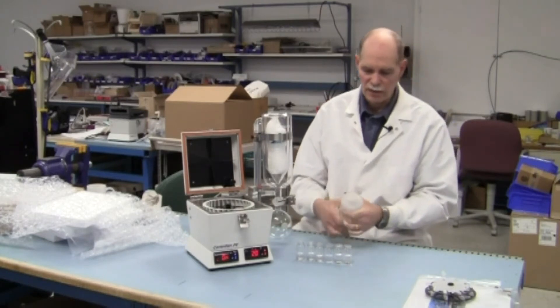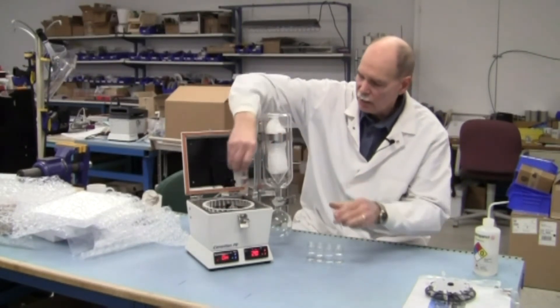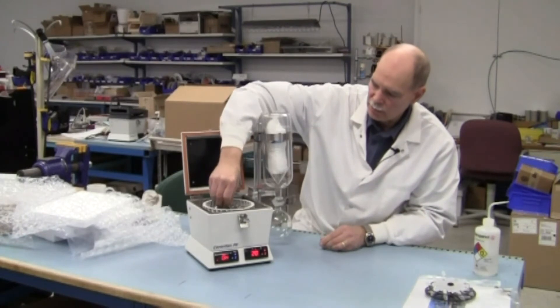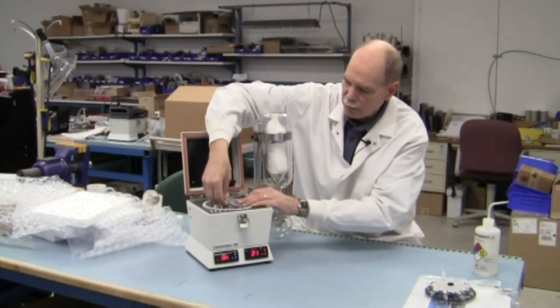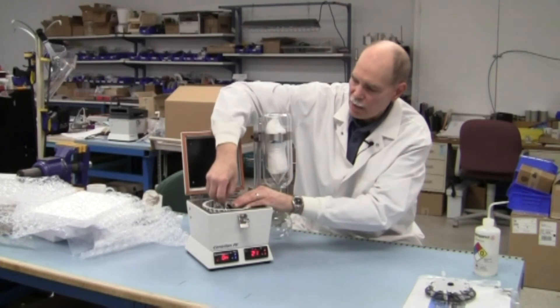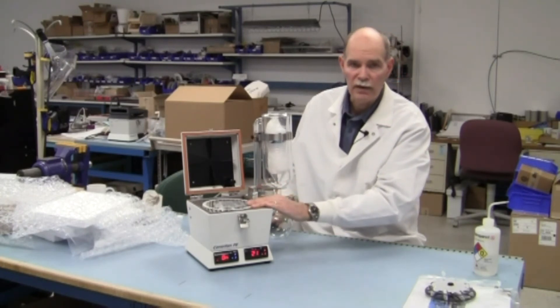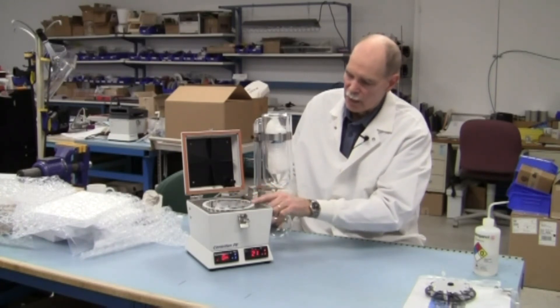Here are six vials of isopropanol. It doesn't have to be exactly balanced — the diameter is small and the RPM low enough that imbalance is really not an issue. If you're only drying one sample, you could put liquid in just one vial, but I'd recommend installing the other five empty vials because you need to install a splitter. This is a piece of polypropylene sheet plastic with a tab that sticks just into the mouth of each vial. It separates the gas flow in and out of the vials to prevent turbulence. Without the splitter you'd just pressurize the vials with no net flow across the solvent surface. The splitter is a patented item that enables evaporation in the vials.